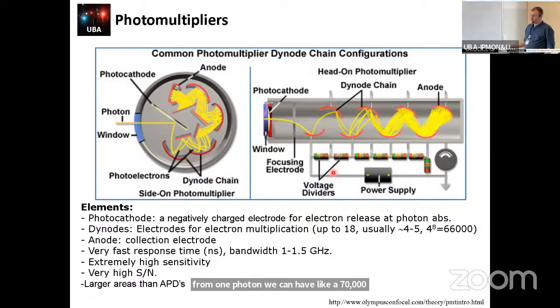And this is something that we will take into account when we try to do fluorescence fluctuation spectroscopy using analog detection. Why are these very useful? Because they are very fast. So we can use these for counting photons. These are important for photon counting, for fluorescence correlation spectroscopy, but also for FLIM measurements. And they can be read really, really fast, which is fundamental for lifetime measurements. And they are very good in signal to noise.